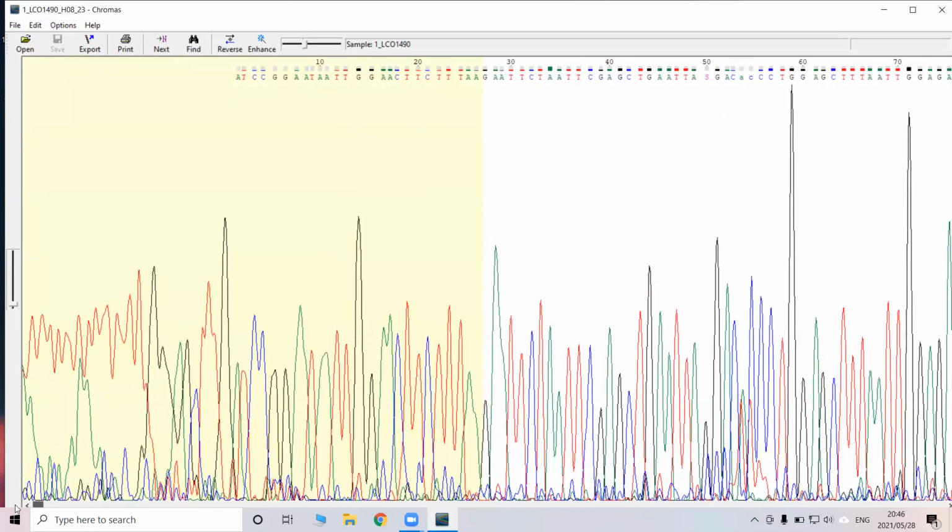Generally in these AB files, at the beginning and at the end of the sequence, we will find a fair degree of noise. These regions of noise are generally characterized by messy peaks that do not have a proper shape, and the assignment of letters being unreliable. So instead of seeing A's, T's, C's, and G's for nucleotides, what we'll actually see are letters like W, R, and Y.